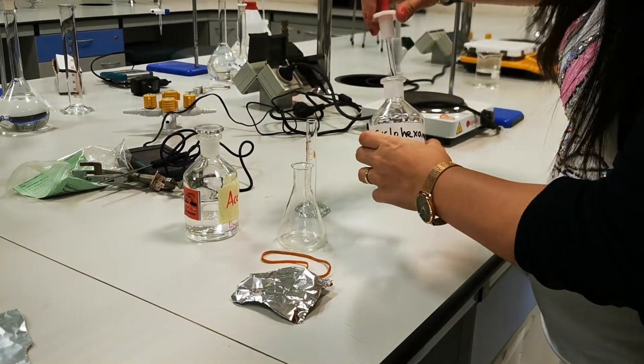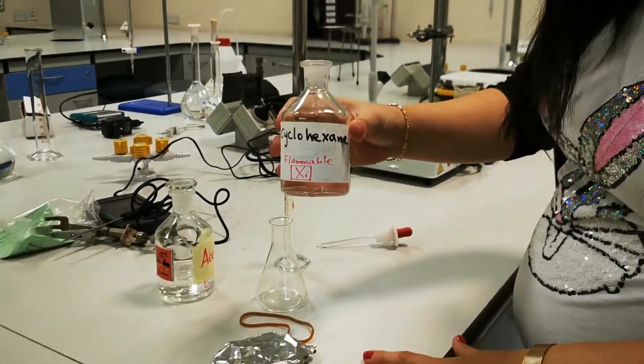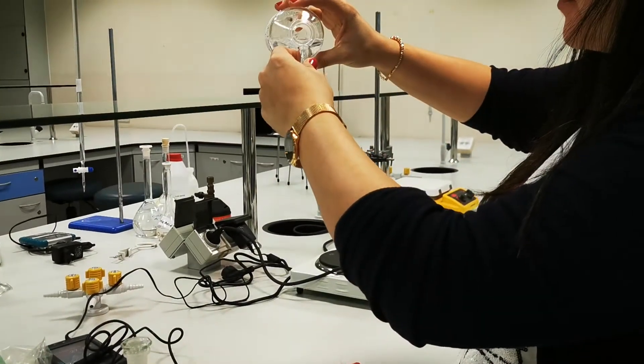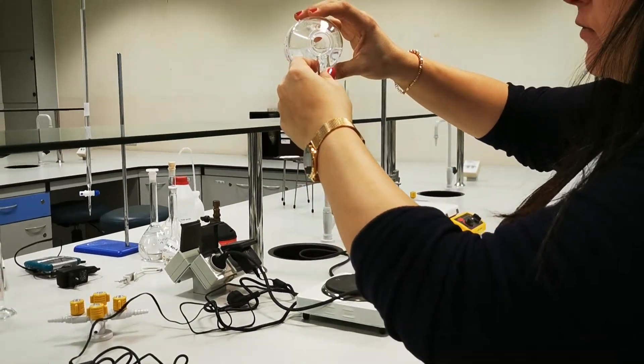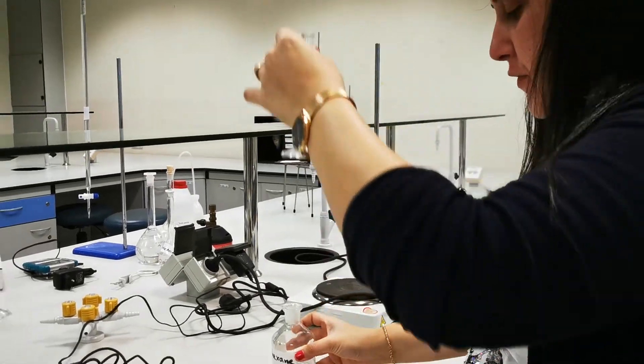I'm going to take now 5 milliliters of a volatile liquid. I'm choosing here the cyclohexane. So, this is 5 milliliters.